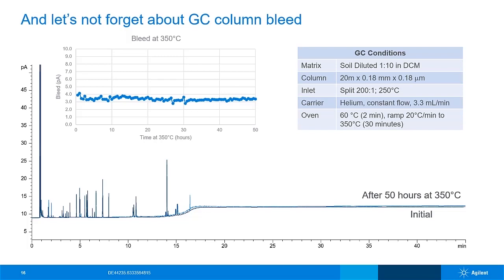So here again, this is another study in which we were trying to analyze and observe what happens during 50 hours in this case. And you can see that the baseline changes were minimal. That means that your bleed profile will help you to be robust in your data.